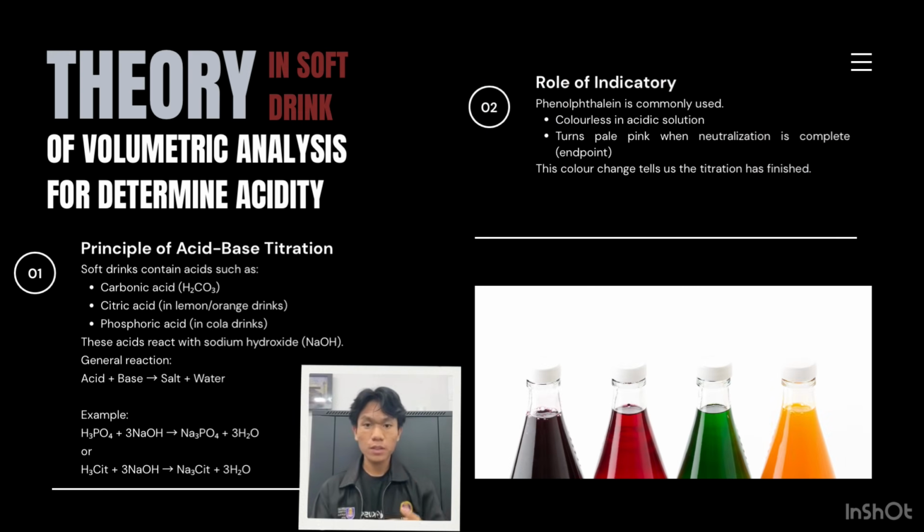Hello everyone, I'm Syazwan, and now I will explain the theory behind volumetric analysis and how it is used to determine the acidity of soft drinks. First, what is volumetric analysis?